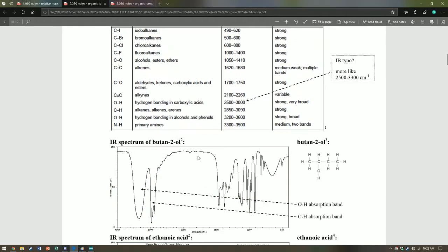This is a sort of transmittance. It's a graph of transmittance versus wave number, and if there was no sample there, the light would just pass through there. It'd be 100% transmittance at all wavelengths and frequencies. However, because certain compounds will absorb certain wavelengths and cause them to vibrate more, you will get these dips here that correspond to these certain wavelengths, right?